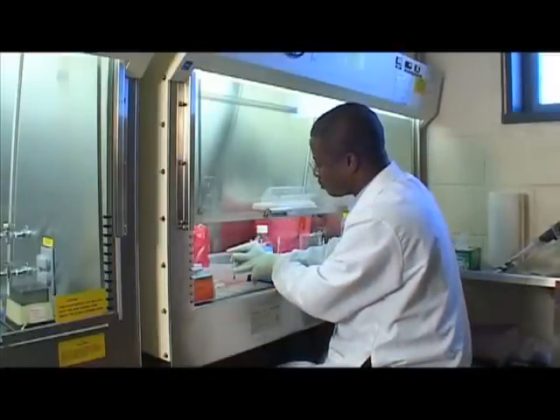This is a very novel method that we developed here, and we were very lucky that one of the investigators here in his lab has been able to come out with an infectious clone of hepatitis C, and that is one of the first whole genome hepatitis viruses that can grow in tissue culture. One of the things about this hepatitis C assay that we're using that's interesting is the way the virus is constructed that allows us to measure whether or not the virus is viable.